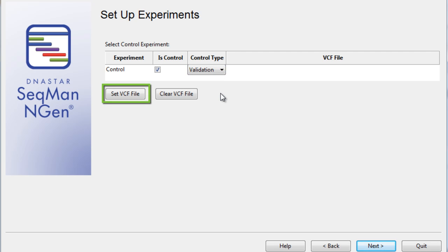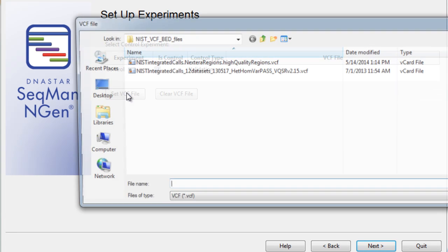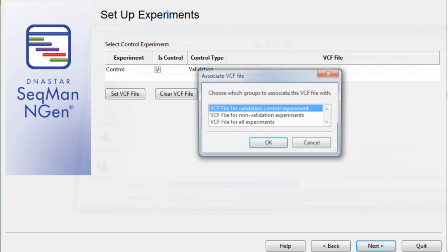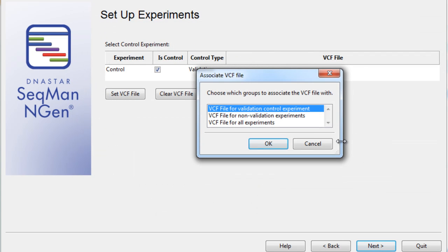Next, I'll set my VCF file. The VCF file contains our high-confidence variant calls, and for our validation control, we will be using the Genome in a Bottle NA12878 high-confidence VCF file. I'll check that this VCF file is for our validation control experiment.